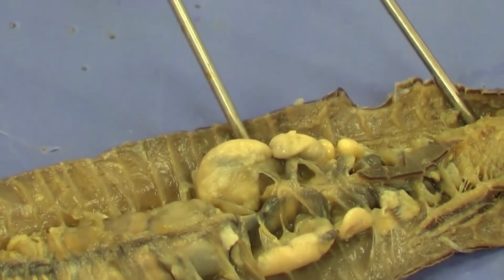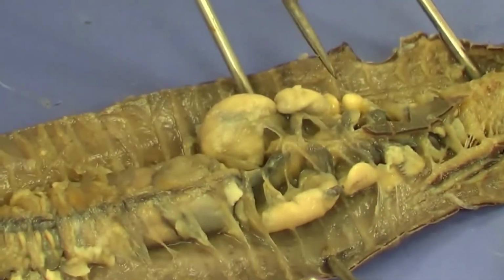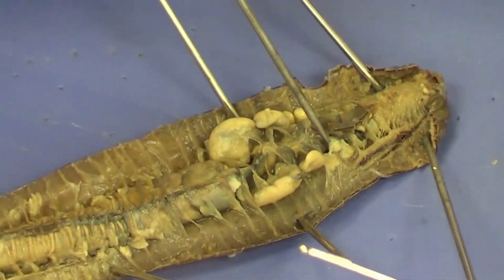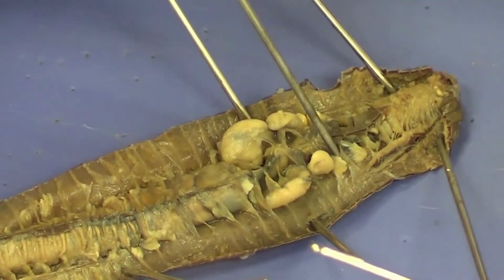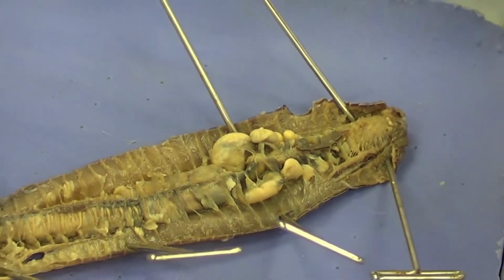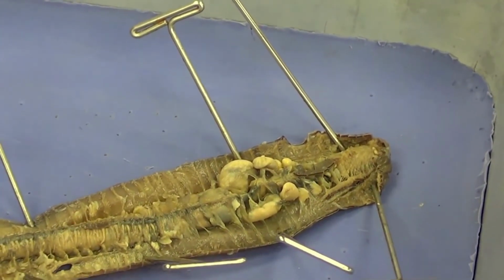Anterior to the seminal vesicles are some smaller structures. You can see it right here. And you can see one right there. And on the other side, they are not as good, maybe down in here a little bit. Those are going to be our seminal receptacles. Those receive the sperm of another worm and store it temporarily until fertilization is ready to take place.